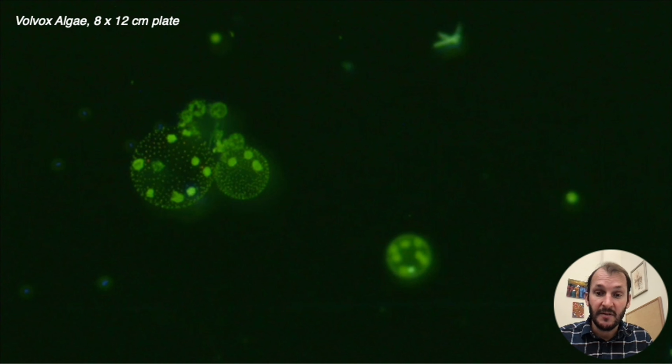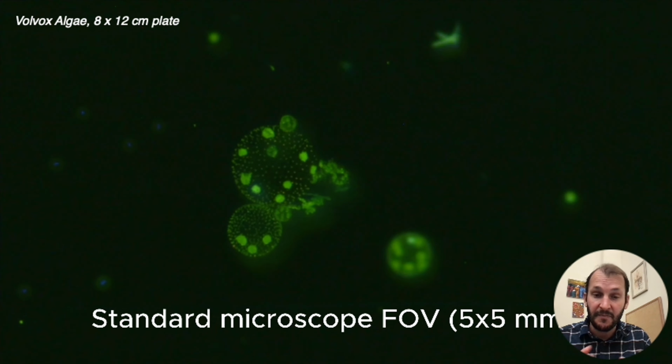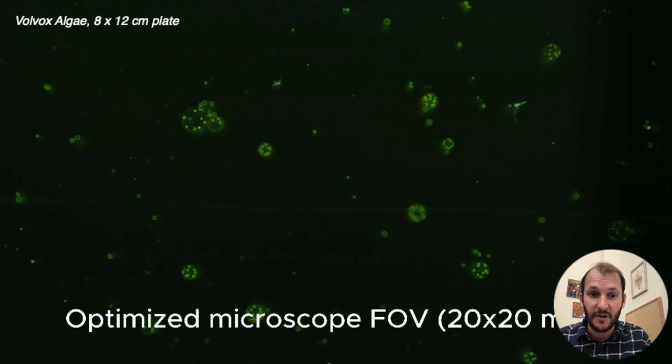So here's an example video of just the type of area this microscope can show. I am going to preface this by saying that it's very hard to show these gigapixel-sized videos on standard screens, right, which just have a million pixels or a few million pixels, right? But essentially, a standard microscope would observe something like this, an area about 5 by 5 millimeters.